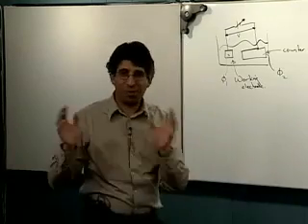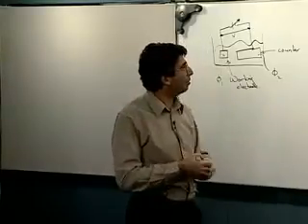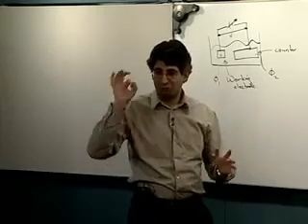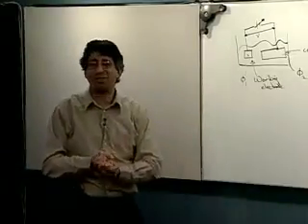So we do it with no air, nice clean electrolyte, clean up our supporting electrolyte really well, hook it up to our fancy new potentiostat, run the thing, zero product. And keep running, don't understand, try all the different things you might try, zero product.